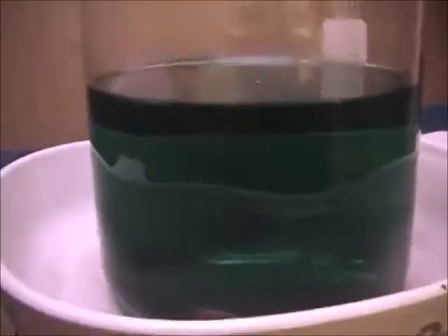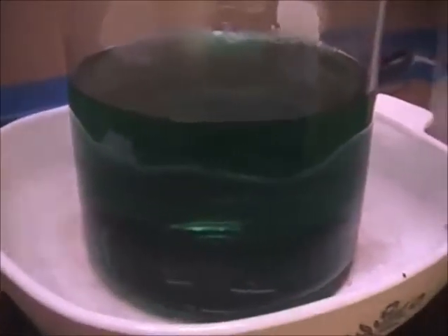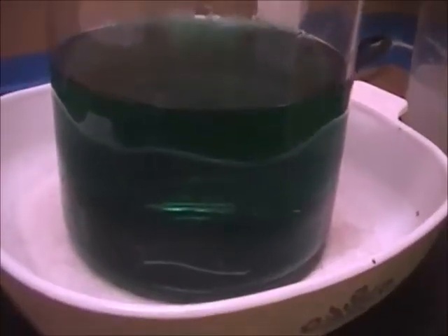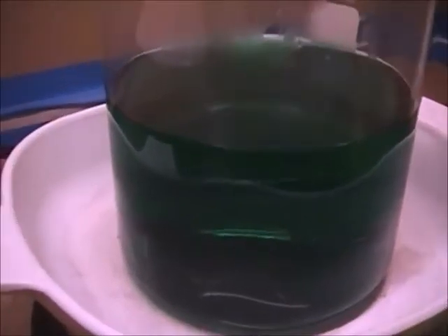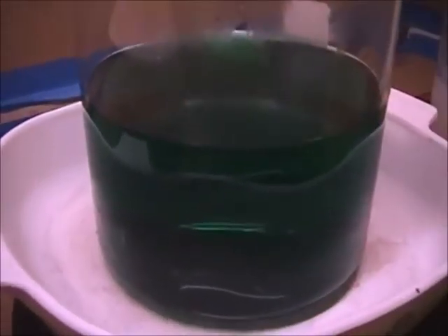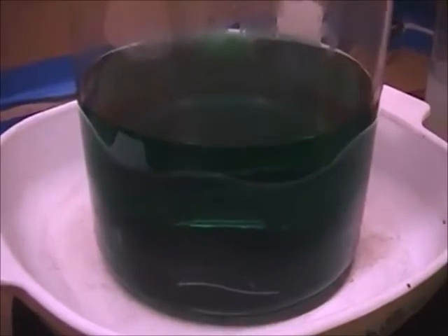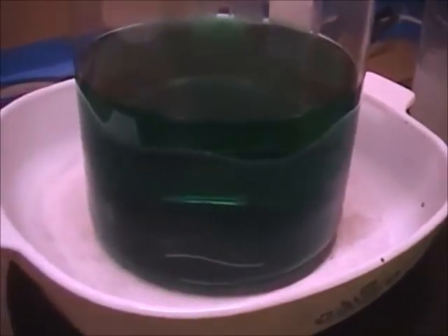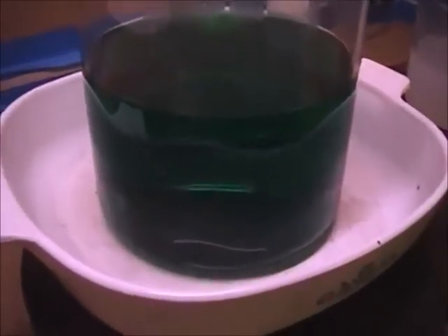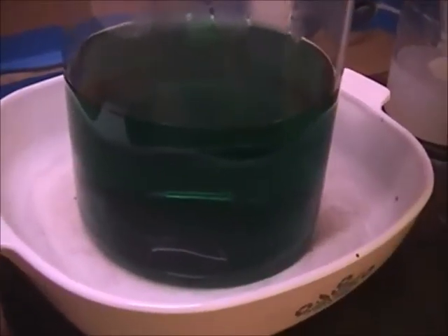I want to give you some reference here to go by, and I'm going to start pouring this sodium formate solution in. Now, I'm not going to measure this. I don't pay much for these chemicals. When you buy them in bulk like this, you should be able to get the sodium formate for about 80 cents a pound, the formic acid about $1 a pound, and the sodium hydroxide's about 56 cents a pound. There's only 1 3/4 pounds dissolved in this whole 2 liter right here. So at the most I'm going to use $1.50 in sodium formate to precipitate this. If I use a little bit more, it's not that bad.